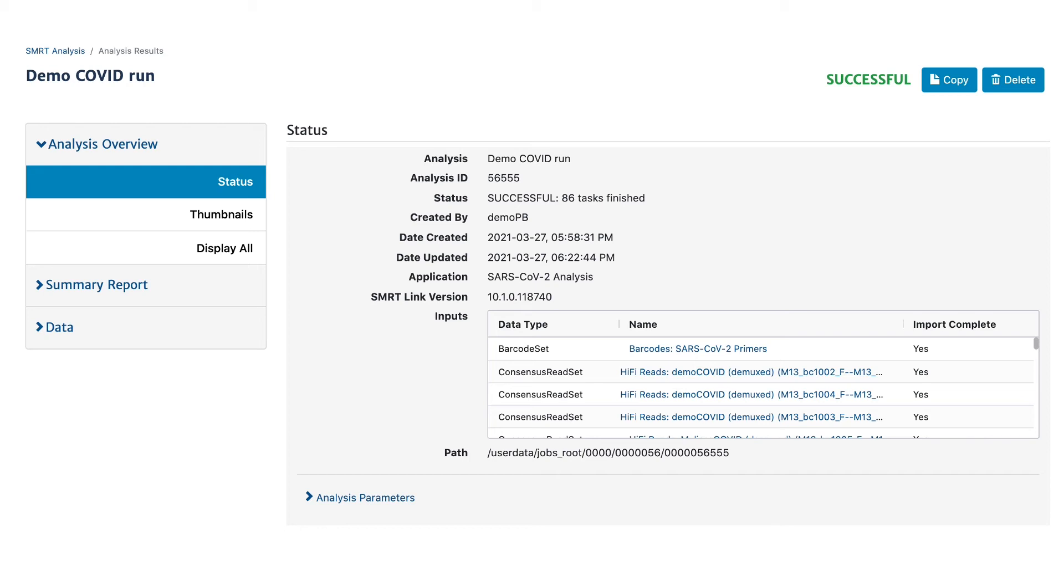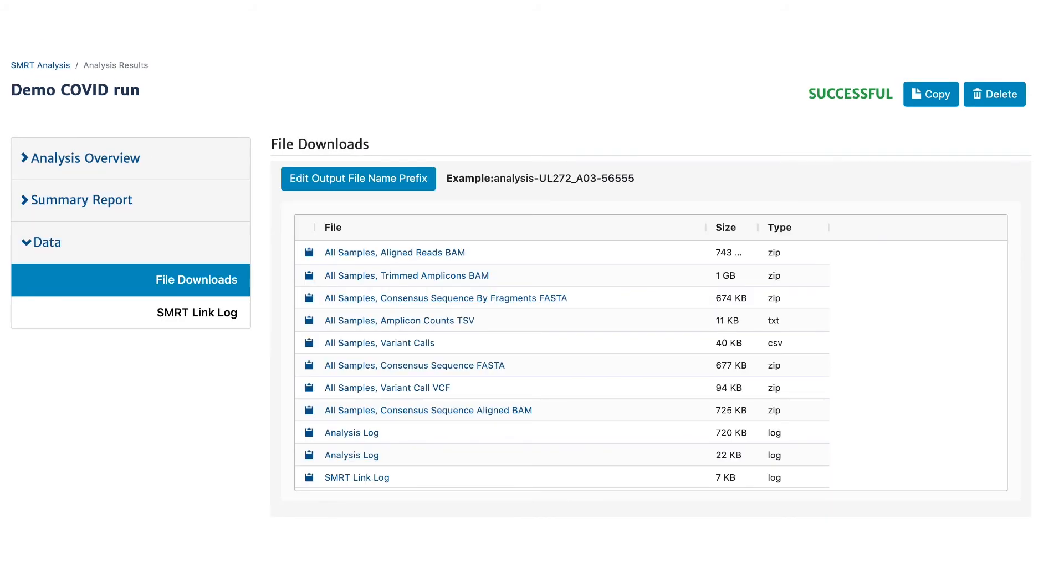It provides two visual reports, amplicon coverage and variants per sample, and a collection of downloadable files that provide all the necessary output you need to upload to public repositories and for further analysis.